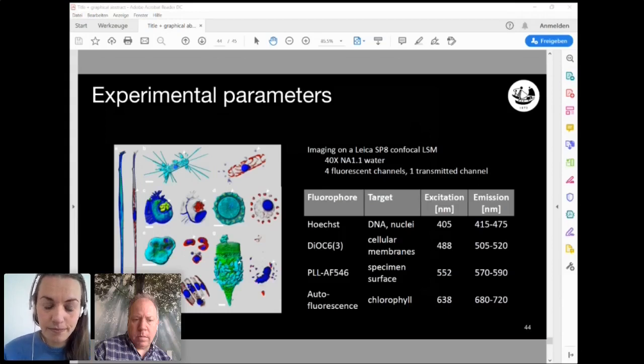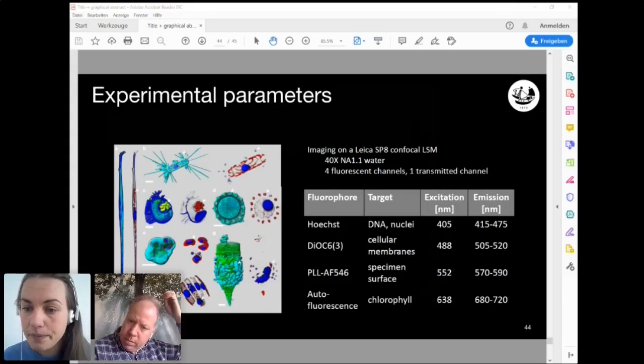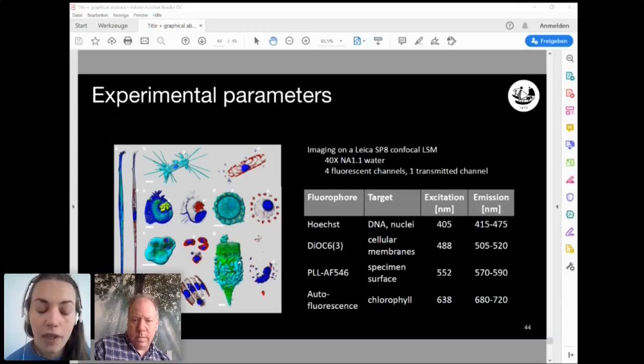Okay. Martin Kenny asks, have you considered using PCA to reduce the number of features you use for classification? Yes, I think Luis has looked into that. I can't tell you exactly the results, but it's something that I also thought would be interesting, to see if we can reduce it to the most important ones and then maybe speed up the processing this way. So maybe the 200 most important ones, where you saw that the curve was still going up very sharply.